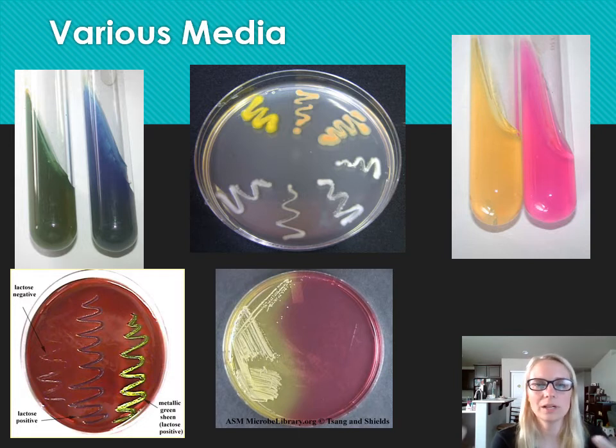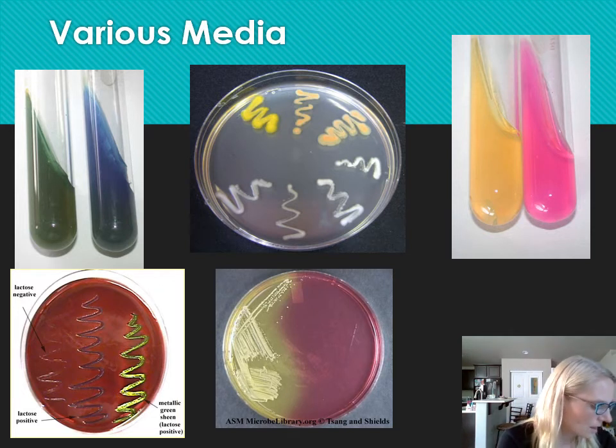It's got all the ingredients. You just don't know the exact quantities of each one. And most of the media that we're using in lab is a complex media. It's got all of these kinds of digests of yeast and protein and things like that.